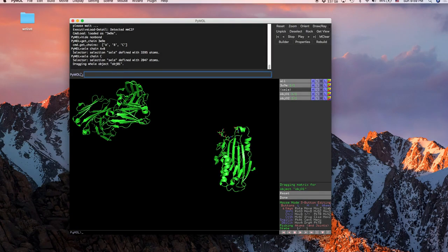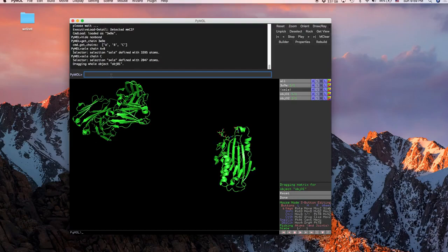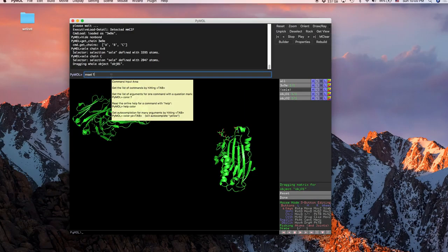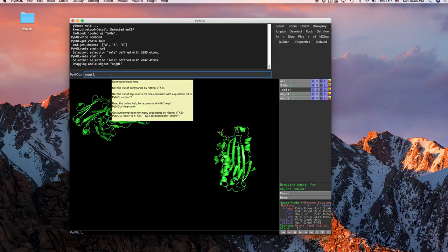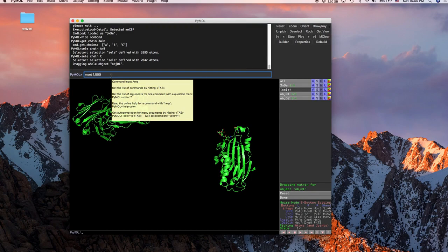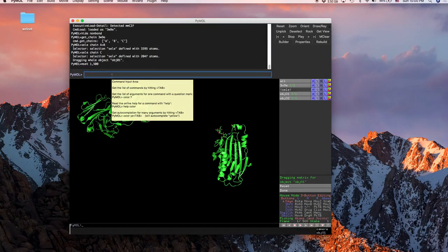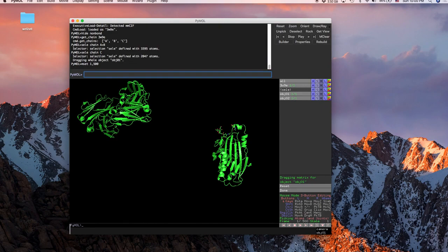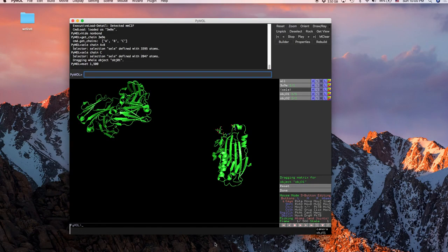So first thing we're going to do is mset, and then we're going to do, always put in one and then just the number. This is going to be the number of frames or how long your movie is, so we're just going to do a short one of 500. Then you'll notice down here where it says frames, you now have one to 500 frames and you'll get this because this is where your movie is going to be.